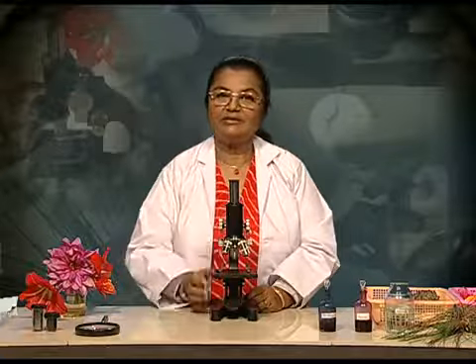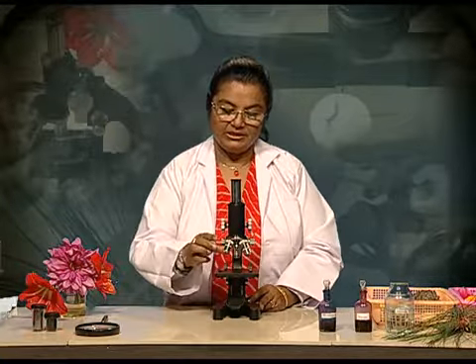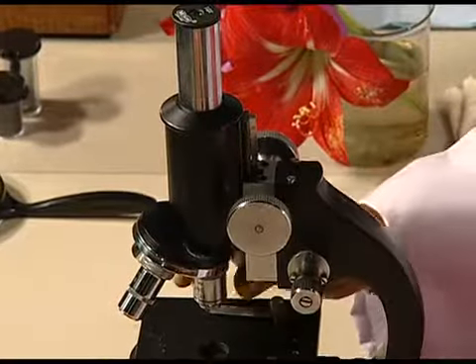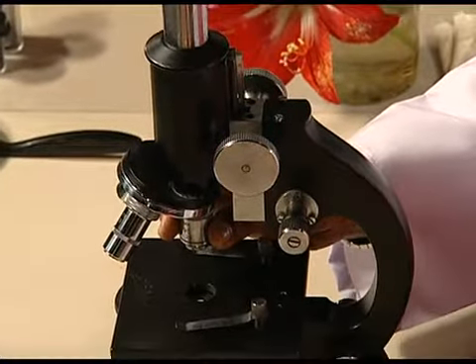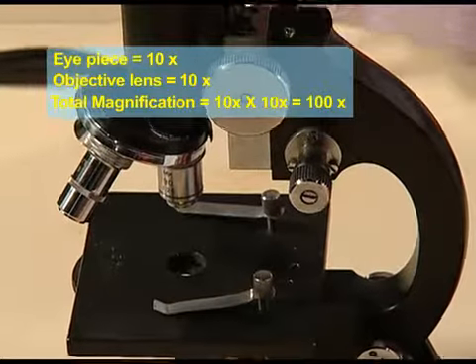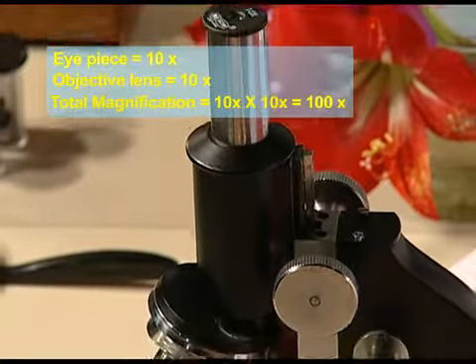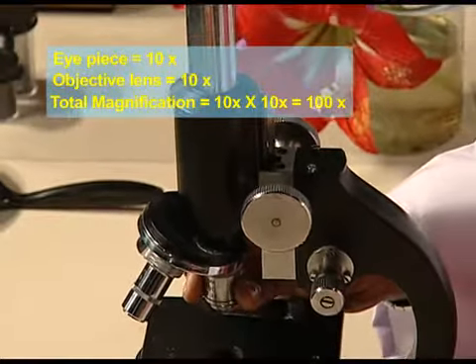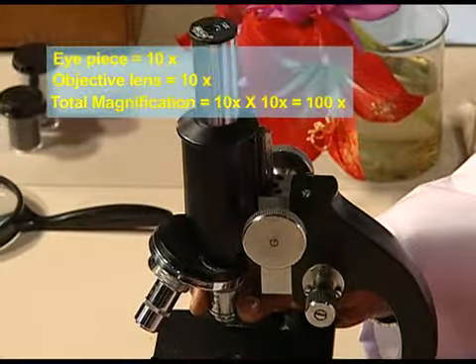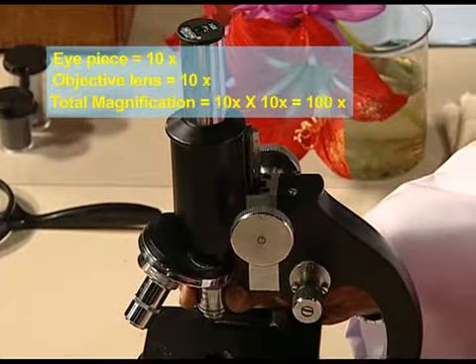Let us combine the magnifications and see how big the size of the image would be. If we look at an object with the low power objective, which has a magnification 10x, then 10x of the eyepiece multiplied by the 10x of the objective will give us a magnification of 10 into 10, that is 100 times the size of the object.